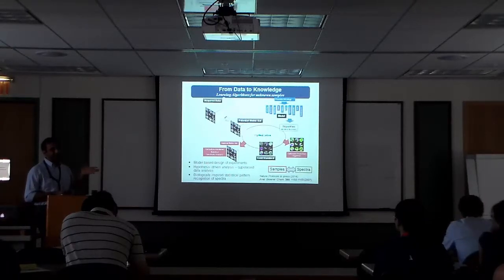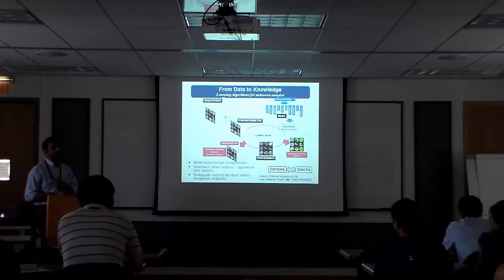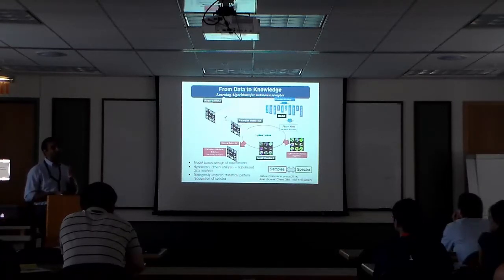And this is the reason why it takes us several months of development to go from acquired data to a full-fledged algorithm, maybe 6 months to 9 months, maybe to a year of development, because we really only publish or only show you things that we've really validated in this way.